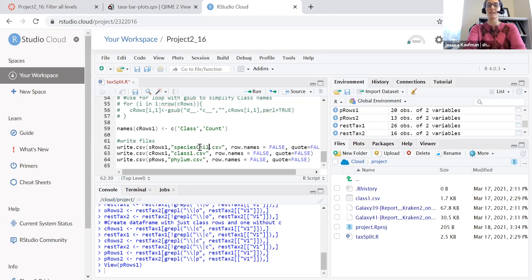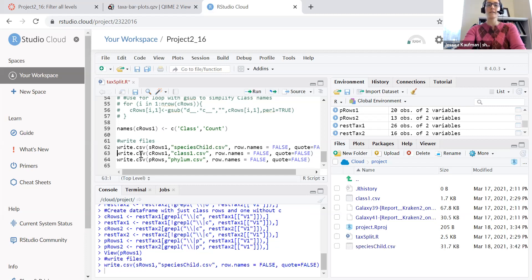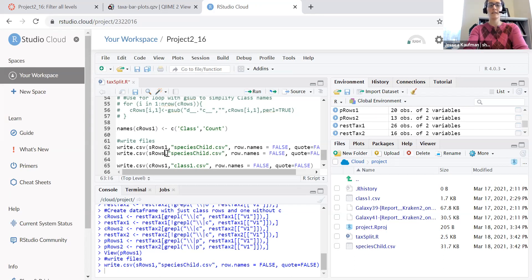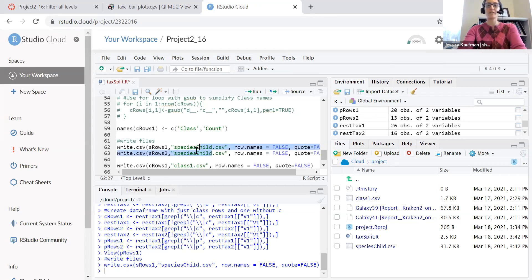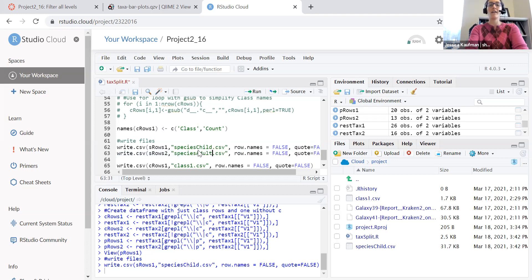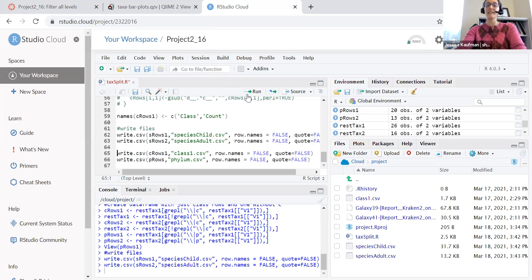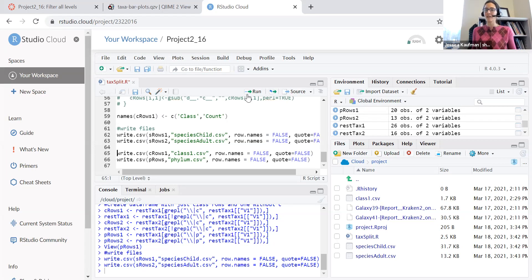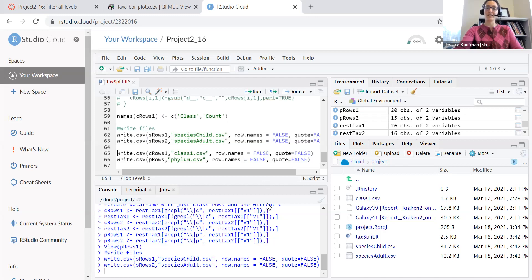So you could call this species child. And then copy that line and write a second file for species adult. You will have a large number of files at the end of this assignment and the files are what you upload to canvas and turn in. Let me know if you have any questions about 2_16.